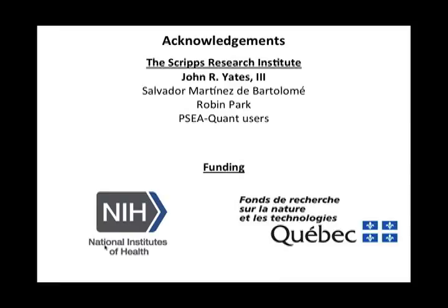Now the output emails that PSEA-Quant gives: when the PSEA-Quant run is completed, an email is sent, since the run requires a fairly lengthy Monte Carlo sampling analysis. That output email now provides more details about the analysis, which was something our users were requesting, such as some of the extra parameters that are selected. And we also provide more tips on how to analyze the data in that email.